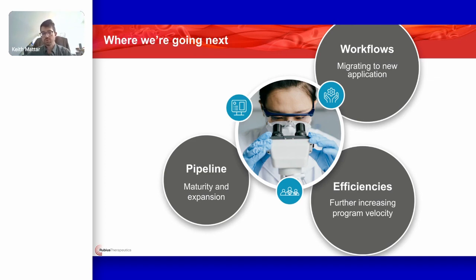Another thing is that we are currently in the process of migrating into the new workflows application that Derek demoed earlier. We're very excited about that. The main reason is that compared to the legacy workflows application, the new version allows for much more granular control and tracking of individual subtasks within a request. We're also looking to convert some of our notebook templates into those new workflows, to make the process of entering the data and going through the experiment even more intuitive.